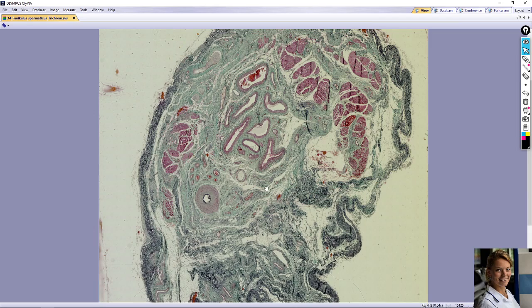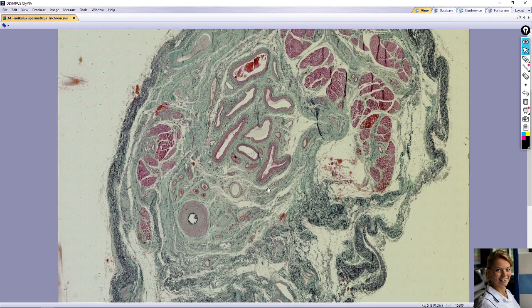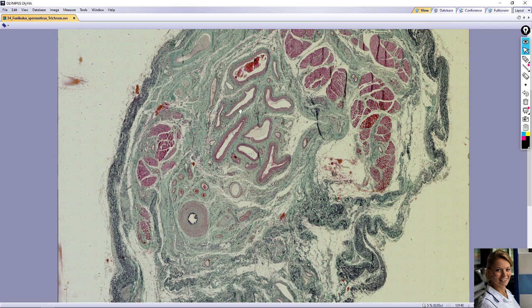The spermatic cord contains many structures: vas deferens and its blood vessels, muscle tissue — this is skeletal muscle tissue here and also here — nerve fibers, and specific veins called plexus pampiniformis and testicular artery. These structures are connected by connective tissue.